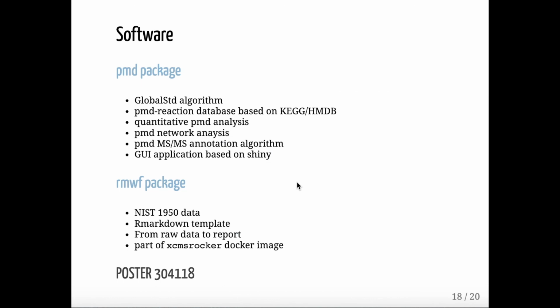So all of the previous study or research can be done by software I developed. It's the PMD package. It includes the global STD algorithm, which is used to reduce the redundant peaks to find only one peak for specific compounds, and then perform the PMD analysis based on those peaks.